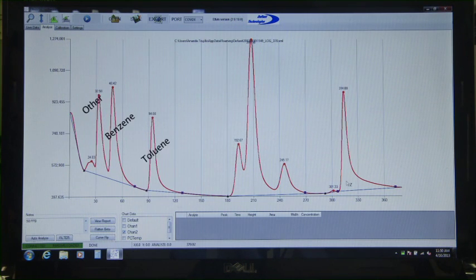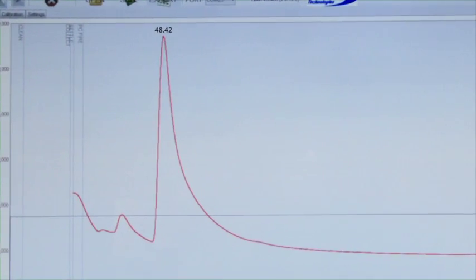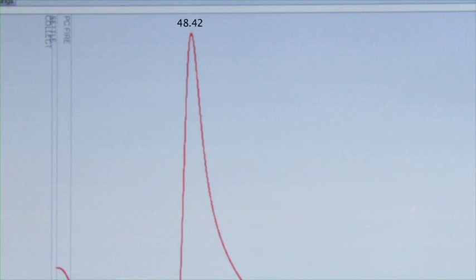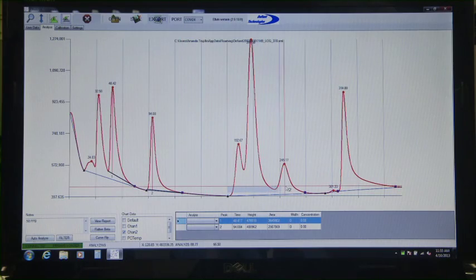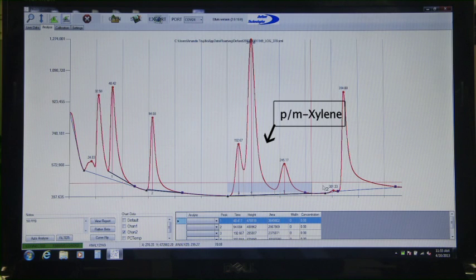Each peak is associated with a different analyte in the calibration standard. If you are ever unsure of the order of elution, the analytes can be run one at a time to determine their individual retention times. Some analytes, like paraxylene and metaxylene, cannot be separated on the Frog's 4.8-meter column, so they will combine to create one peak.